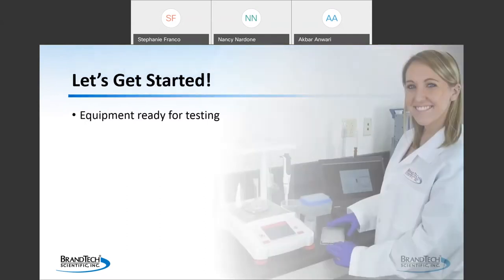So you have your instrument ready to be tested, a balance with the appropriate resolution, distilled or deionized water, and a thermometer to measure the temperature. All are equilibrated to room temperature. And to get the proper temperature reading, it's recommended that the thermometer be placed in a separate vessel containing the distilled or deionized water and the temperature recorded at the beginning of the procedure.